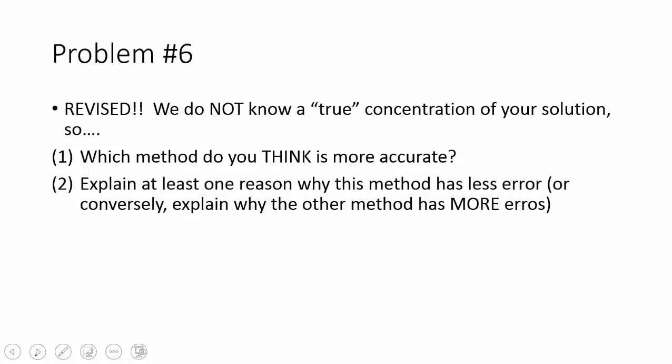And then the last problem, unfortunately, we don't really have a good true concentration of your solution. So I'm actually going to revise this problem a little bit. I want you just to say, which method do you think is more accurate? So which value do you have more confidence in, your titration value or your gravimetric analysis? So it's helpful to think about which kind of method you think gives you better data.